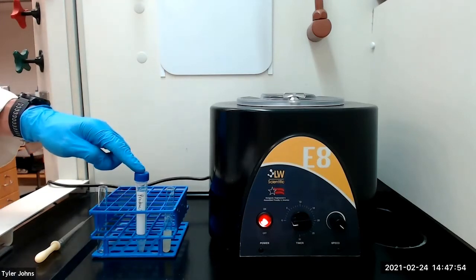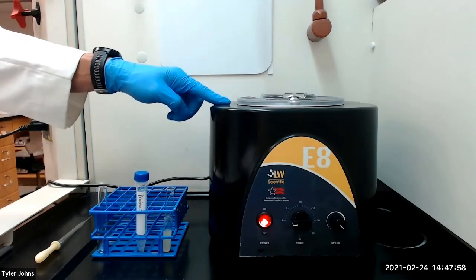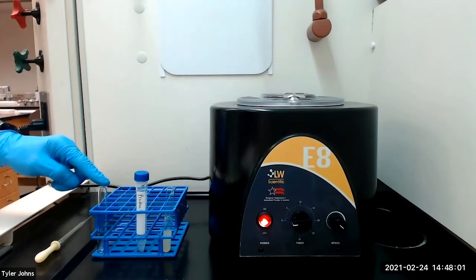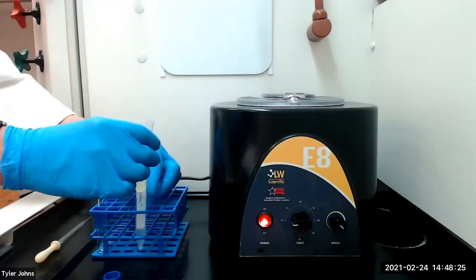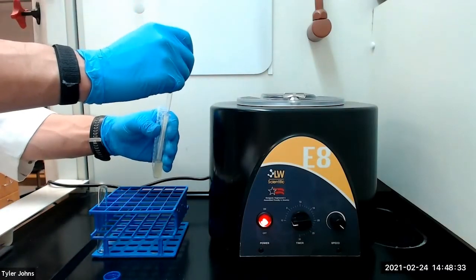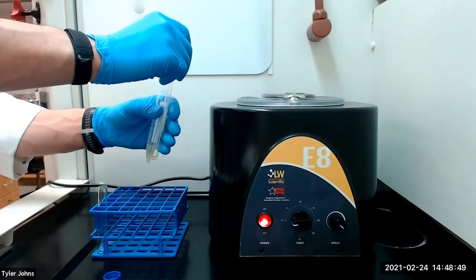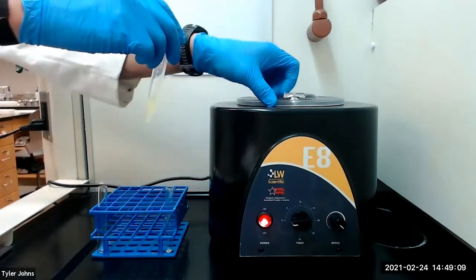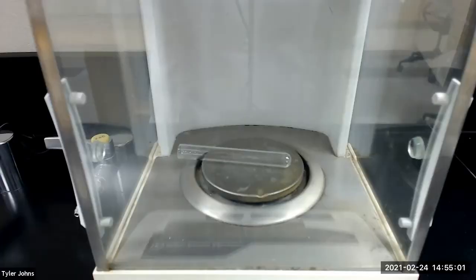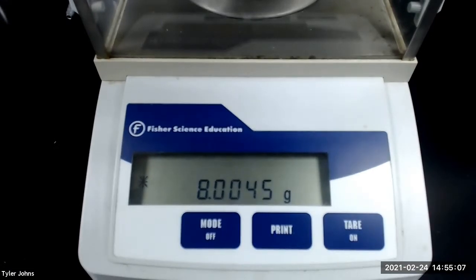We will then centrifuge the acetone extract for 2 to 3 minutes until the liquid clears. During the centrifugation, we will pre-weigh a new dry test tube. The mass of the pre-weighed test tube is 8.0045 grams.